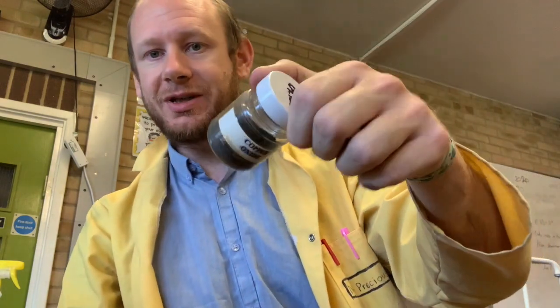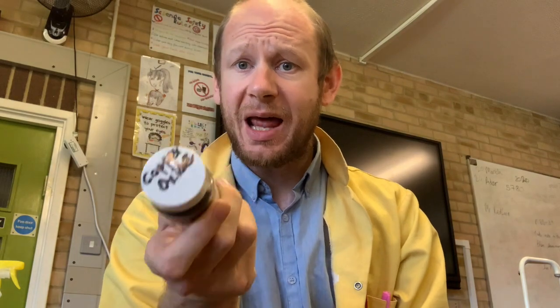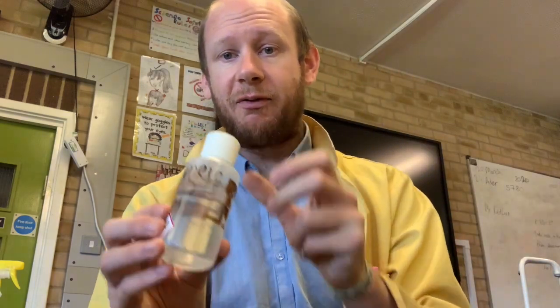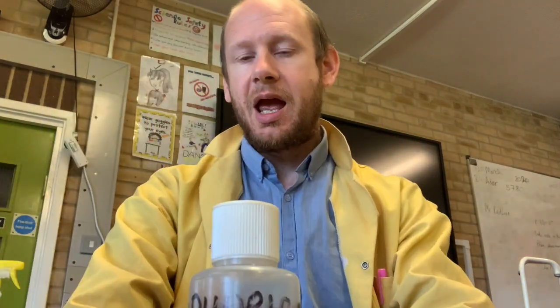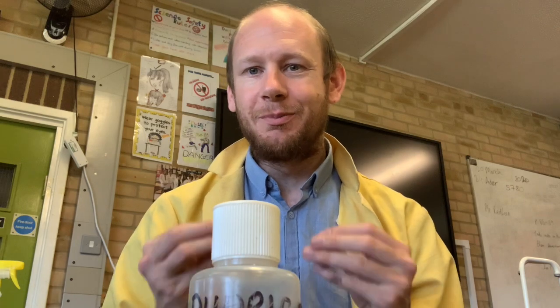It's this black powder here. This black copper oxide will react with my sulfuric acid, which I have here. By reacting these two together, I'm hoping to create a solution of copper sulfate crystals. And then by evaporating off the water, we'll get some pure solid crystals of copper sulfate. Let's have a look at what that will look like.